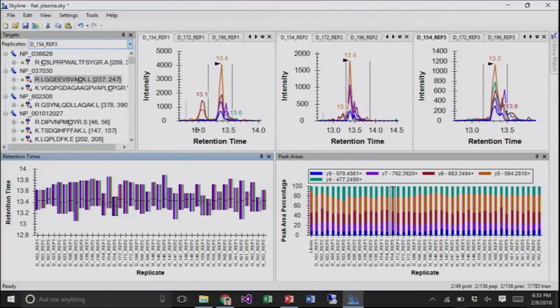And so if you have chromatograms where you can see two other peptides on either side of your target that you're always measuring, and then your target peak goes away, but those two other peptides stay there, you can use that as confidence to say that your target peptide is not measurable, and it hasn't just moved outside the window. But the other thing is that they're dangerous because they don't all shift exactly the same way. And so if you have peptides that are really close to your peptide, they can actually shift into your peptide.